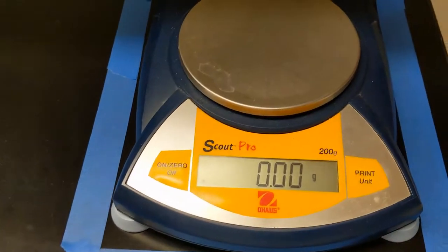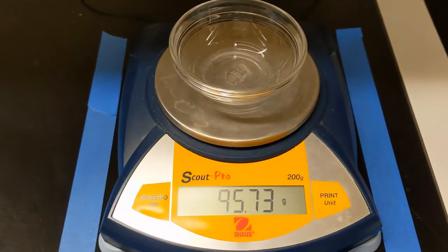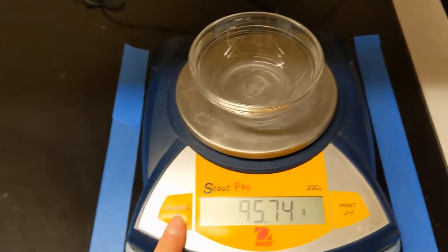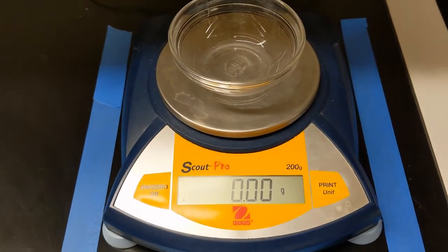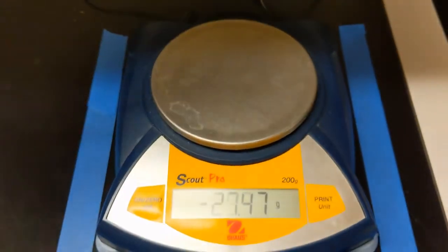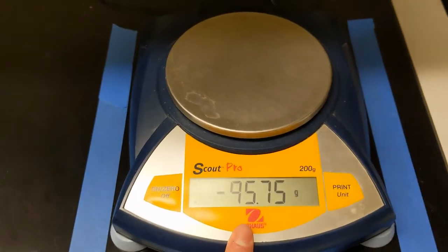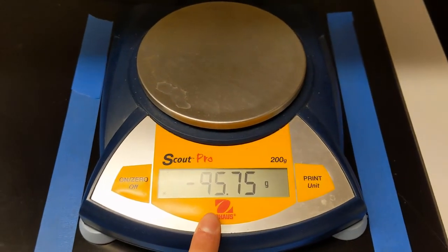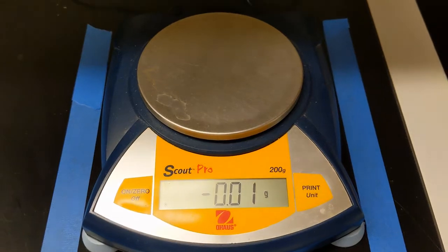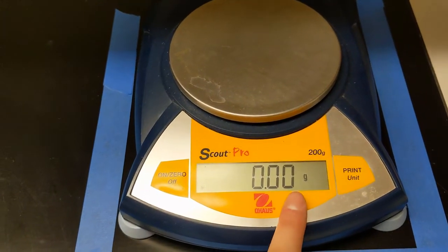If our balance is not zeroed, for example, let's say I have my container on top. Well, this includes the mass of the container, and I do not want that. So what I do is press this on/0, and now it considers this point to be our starting point. But notice, if I take that container off, my balance thinks that I'm starting with negative object on top. I don't want this, so I'm going to click 0 again. And now, let's do it one more time. There we go. We are at a fresh slate. Now, sometimes it might read a little bit of error on top, which is fine. This is fine to start with.